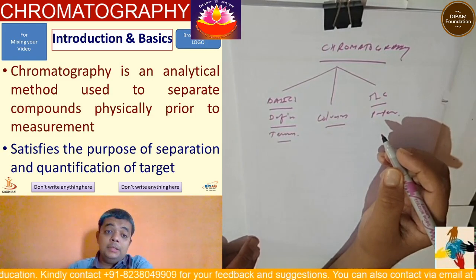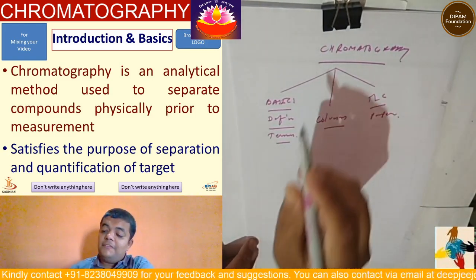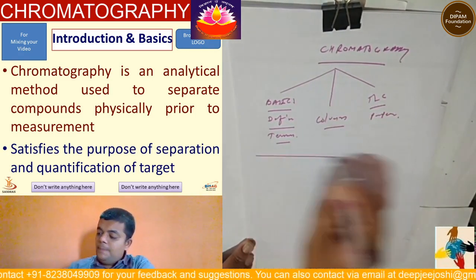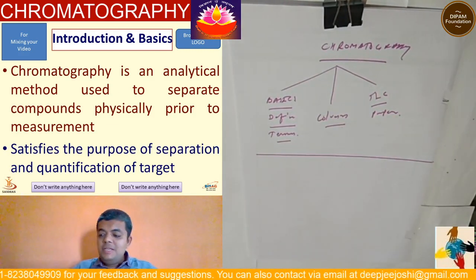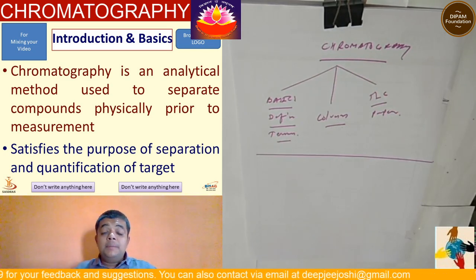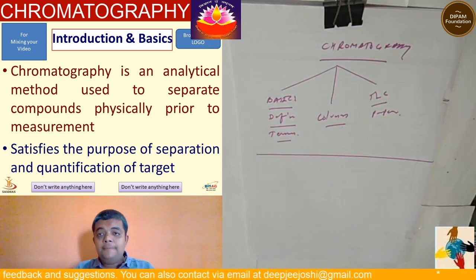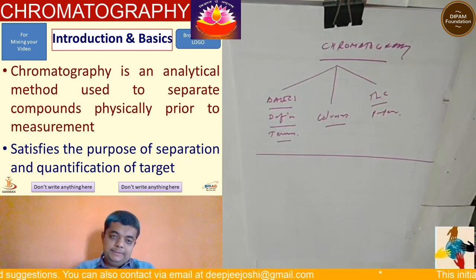A very explanatory note was given in the first talk of chromatography regarding the classification of chromatography. I'll repeat the same because now it's in the global language. So, friends, whenever we talk of chromatography, let us first make it very clear that it's a separation technique. It's a physical phenomenon that helps us in separating compounds prior to analysis.